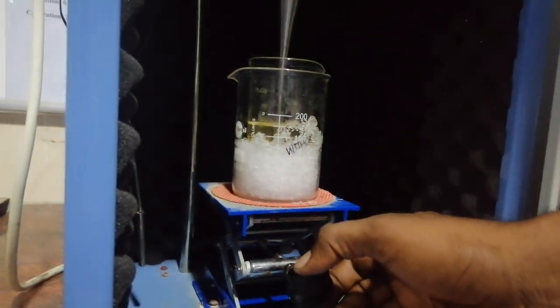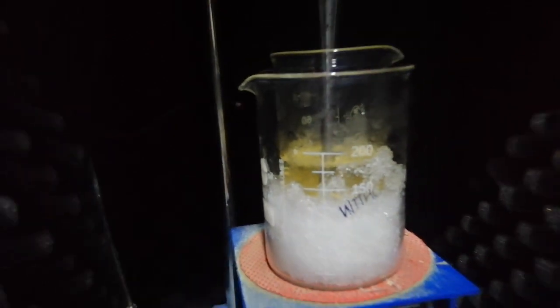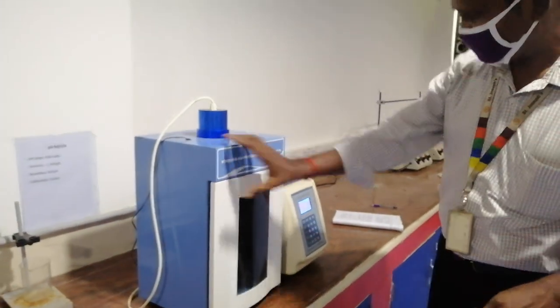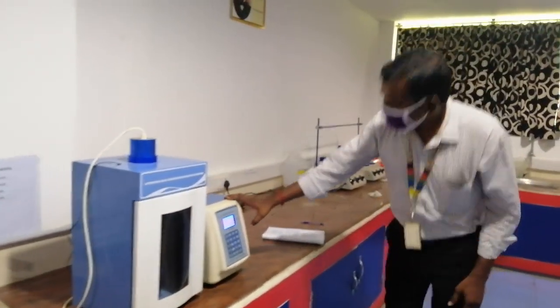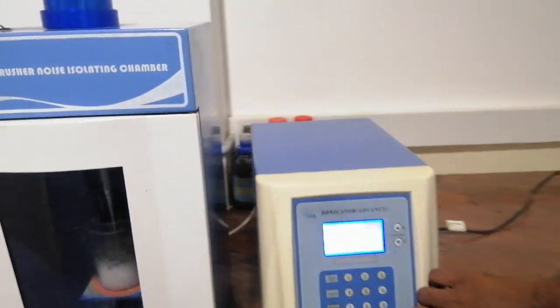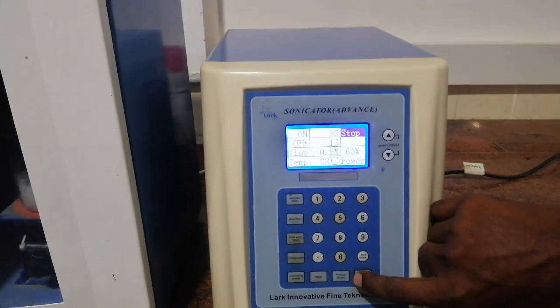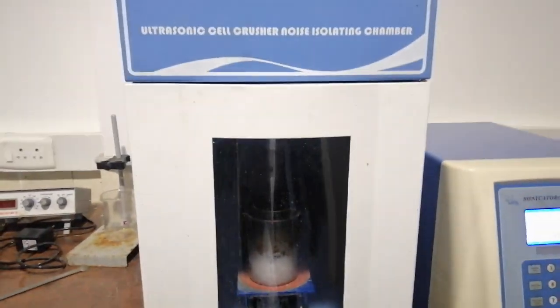Now you can see your ultrasonic probe is immersed in the sample. It is adjusted so that it is not touching the bottom or side wall of your beaker. Therefore, this will not break your beaker. Okay, so now it is closed. Now if you press the on button, then the ultrasonication will start.